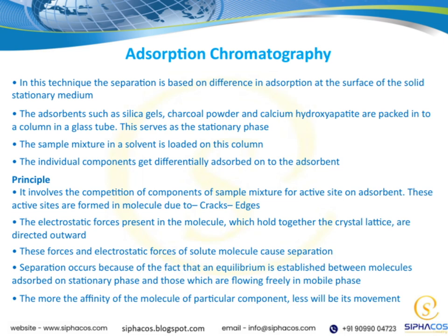As the mixture flows through, each component interacts differently with the adsorbent. Some molecules will adhere more strongly, while others will pass through more quickly. This differential adsorption is what allows us to separate the mixture into its individual parts. Now, let's talk about the principle behind this process.